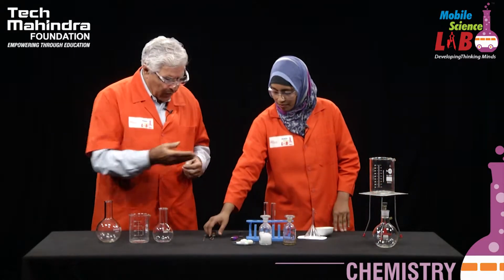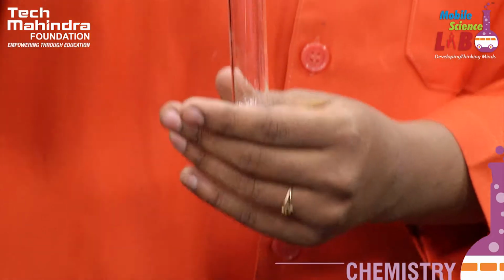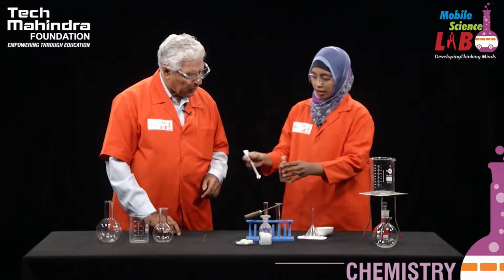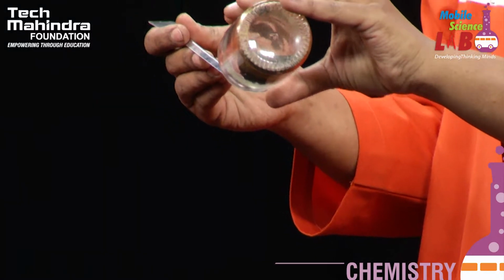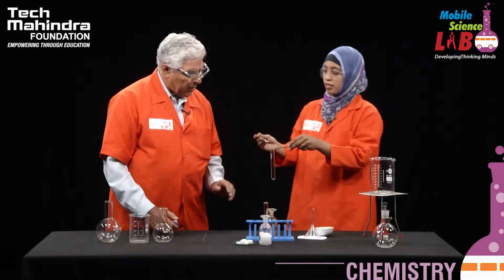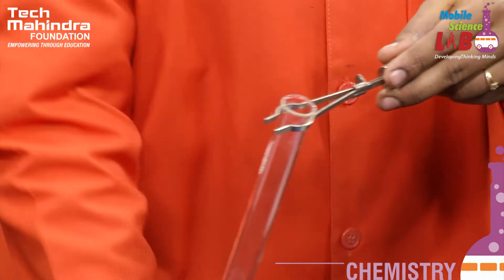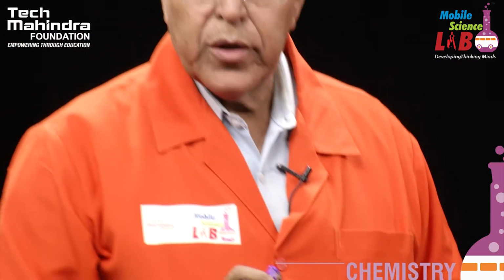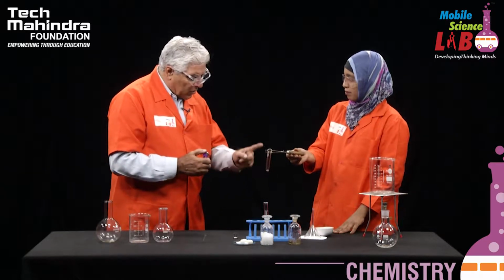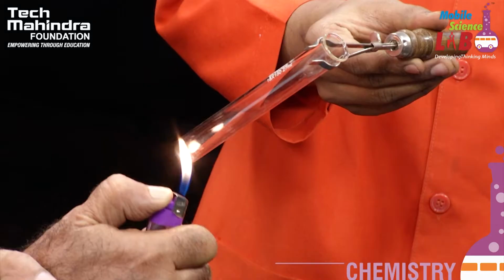Right. Now please do that. So, students, I'm holding the test tube with a holder. I'm taking a few crystals of iodine. I'm putting the iodine in a dry test tube over here. Now I'm not using a burner, I'm going to use a lighter, and Khatija, you just watch what happens over here. I'm gently going to heat it. You keep it steady.